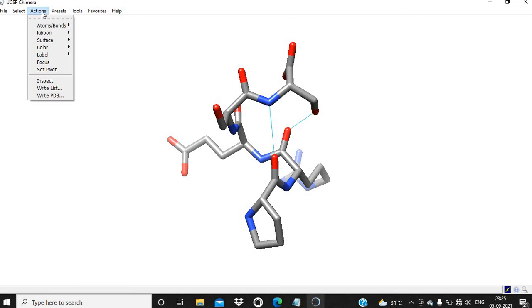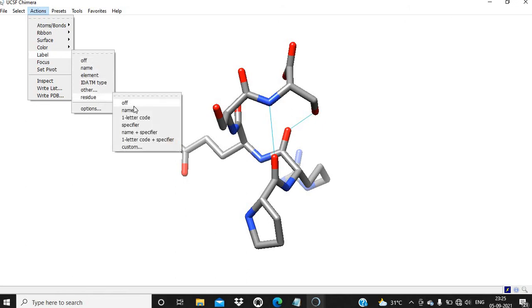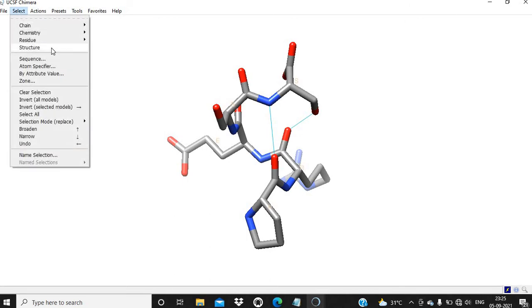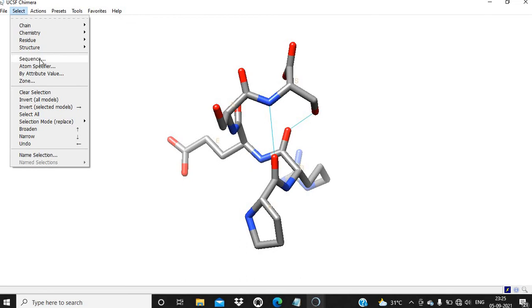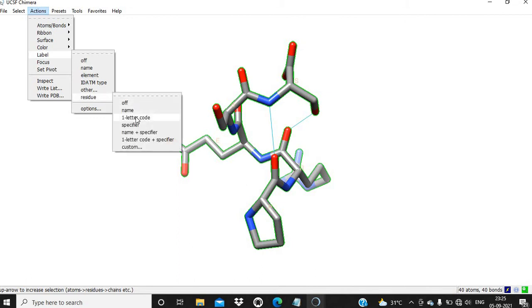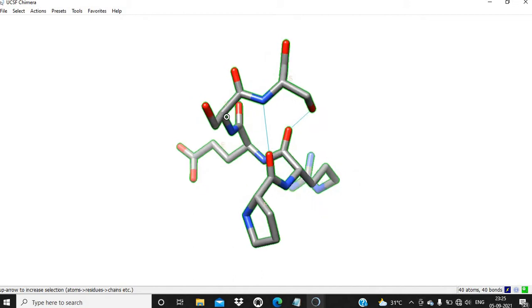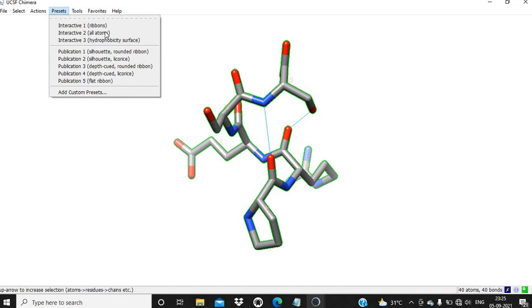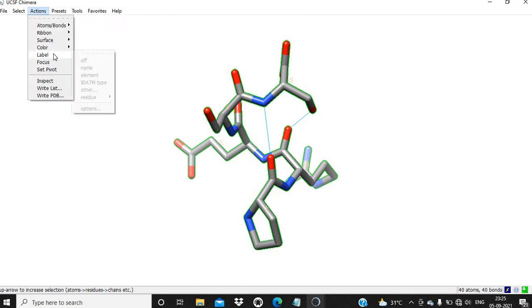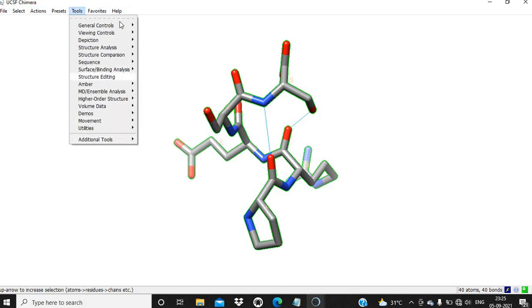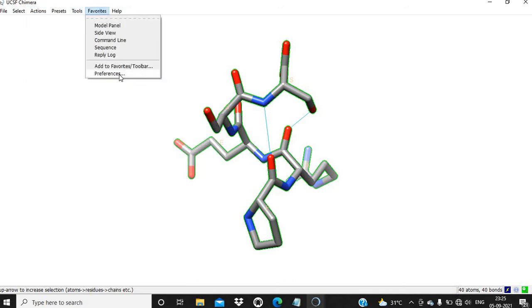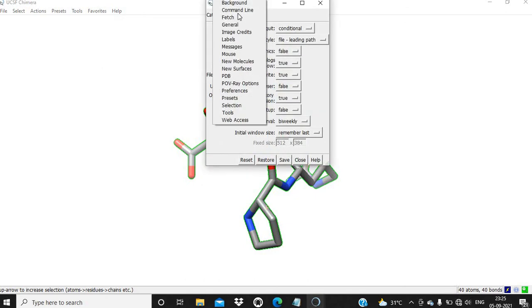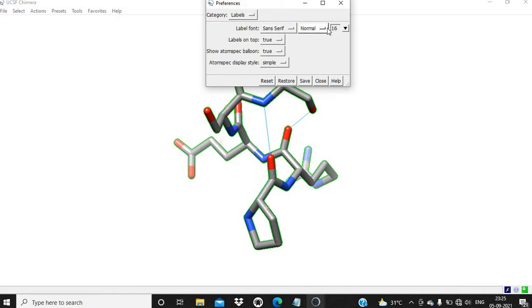We can also label the residues in the peptide. Label, residue, one letter code. Let me select first, one letter code. It's not appearing. It's here, but it's not visible.